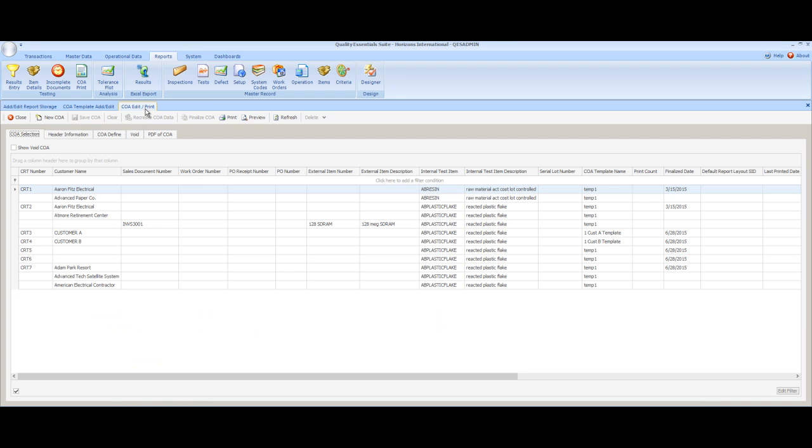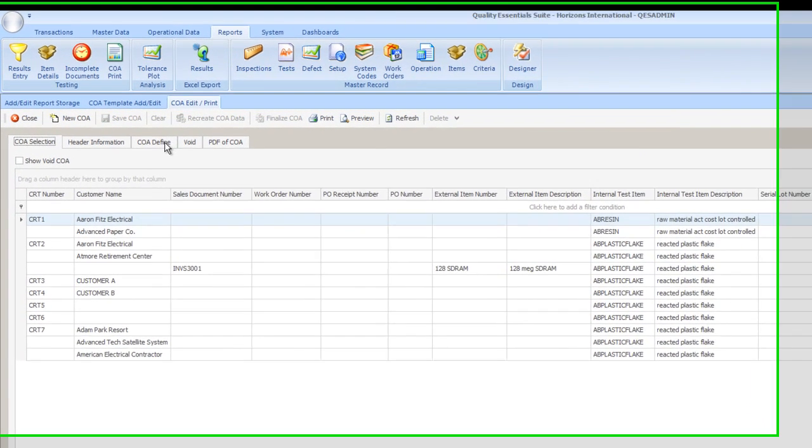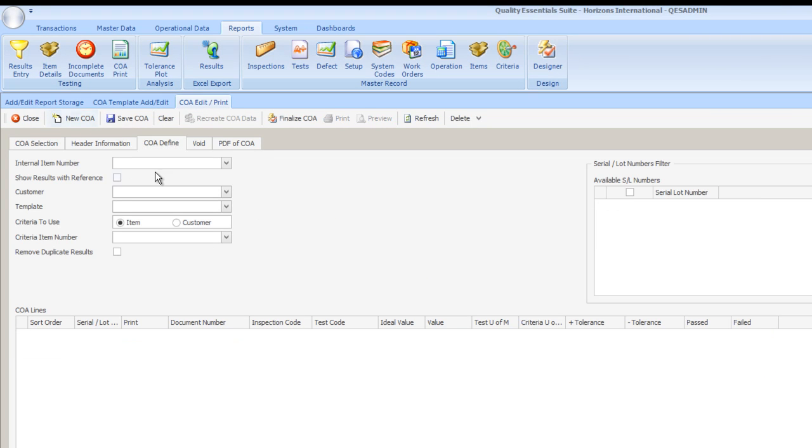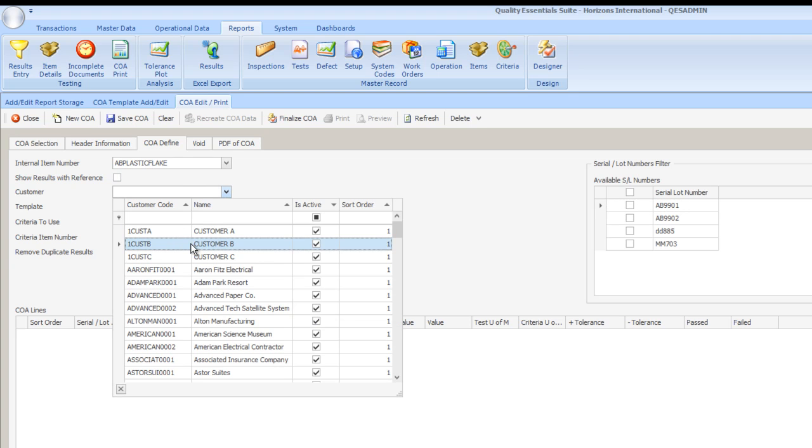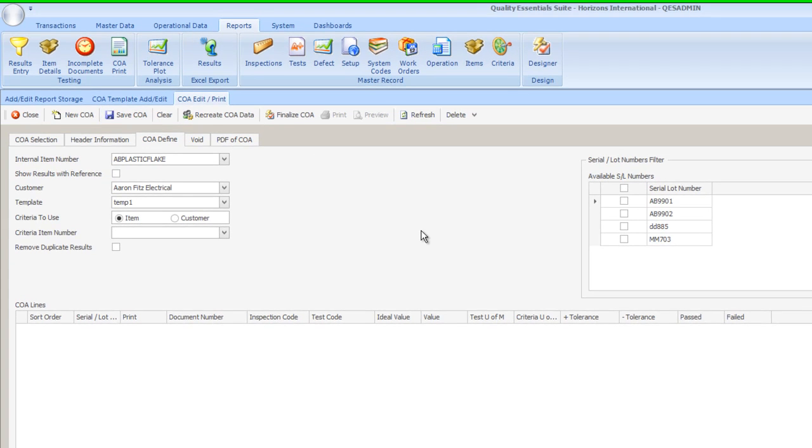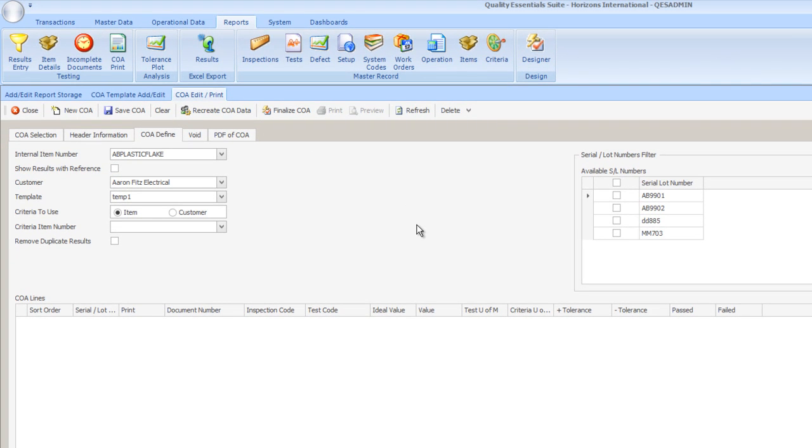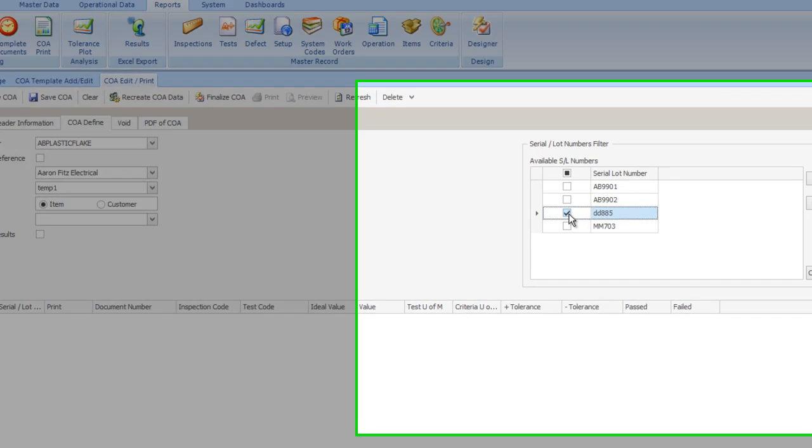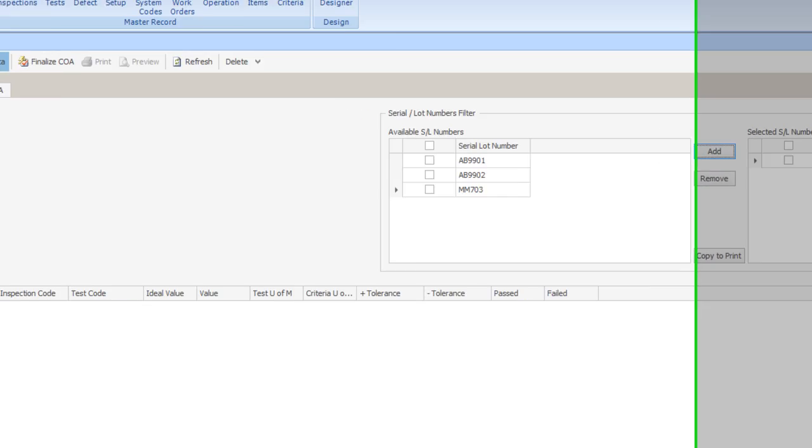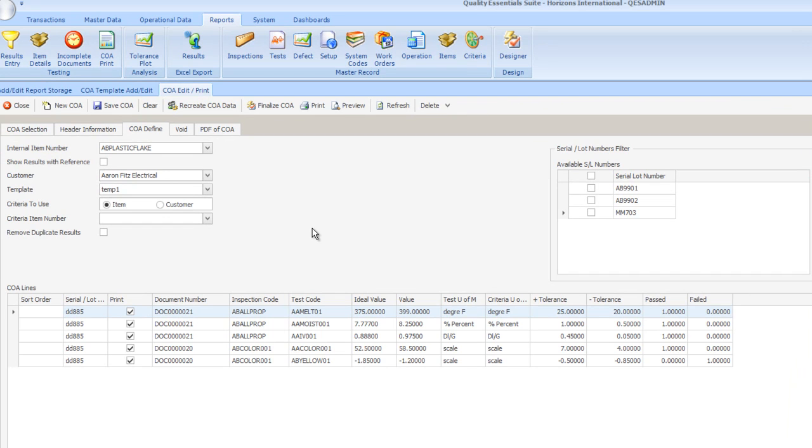In the COA Edit Print Form is where we begin the process of creating new certificates of analysis. We start by clicking on the COA Define tab and then selecting New COA. We're going to build these examples using our AB Plastic Flake item. We'll select a customer and then we'll select a template. For the purposes of our example, I'm just going to use template 1. In this particular case, what we're going to do is we're going to look at report choices for reporting on just the information for a single lot. I'm going to select the lot DD-885 and add it to my data and then search my database using the Recreate COA Data button for all of the test results related to this template and this lot.